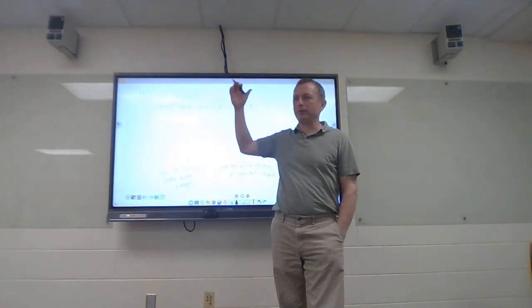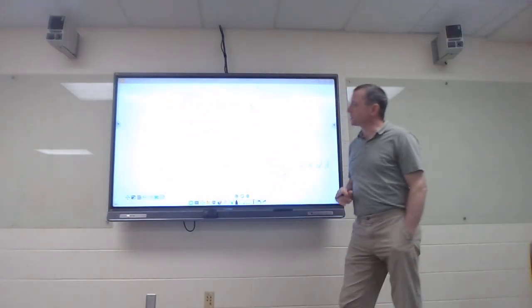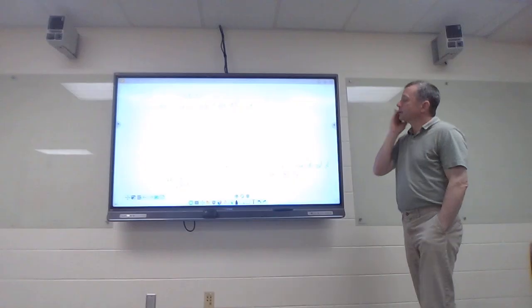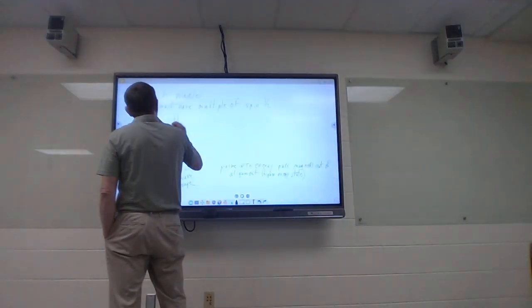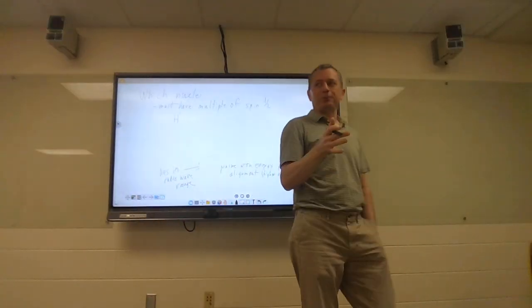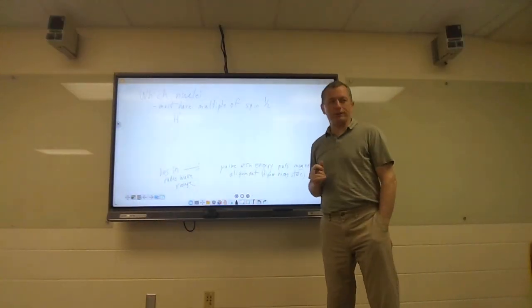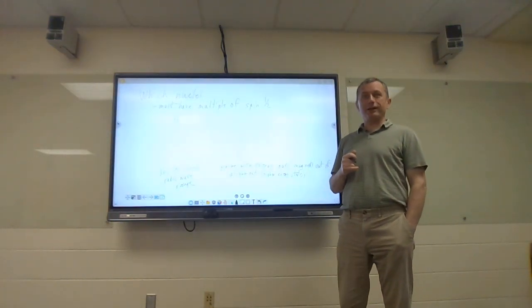I don't know all the math behind that, but they have to have a spin of 1/2. So examples: hydrogen, and we have to look at specific isotopes. So hydrogen-1, not deuterium, not tritium.